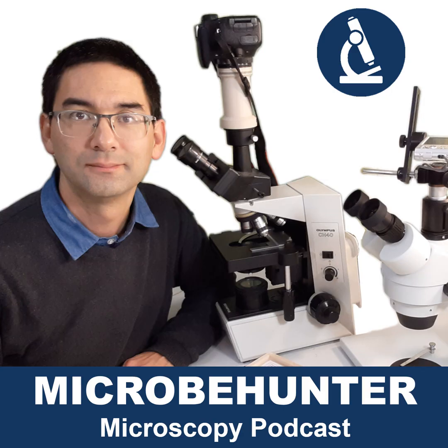Let's say that you should be able to see a certain structure because it is fairly large, but you still have a problem seeing it. And why could this be? There are two reasons for this. The next reason could be generally a low color contrast of the specimen to the background.